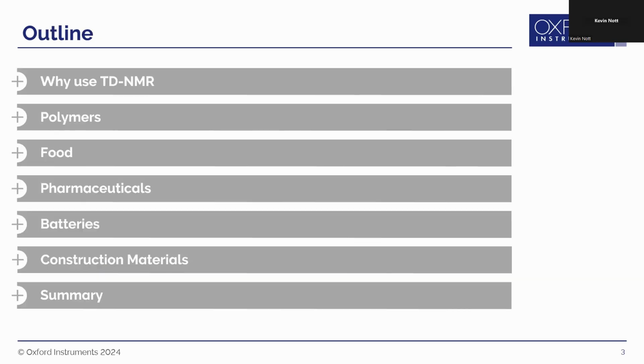So the purpose of my talk is to contrast the TD NMR against the NMR spectroscopy measurements, describe its application to a variety of materials, as well as giving some perspective of current and future uses in the polymer, food, pharma, battery, and construction industries.